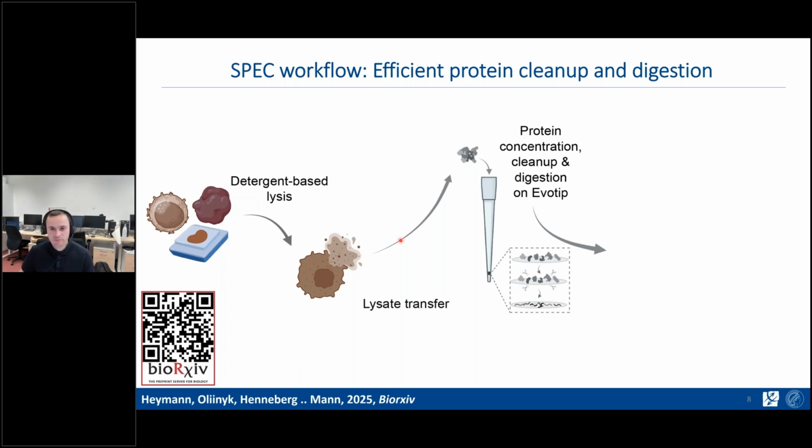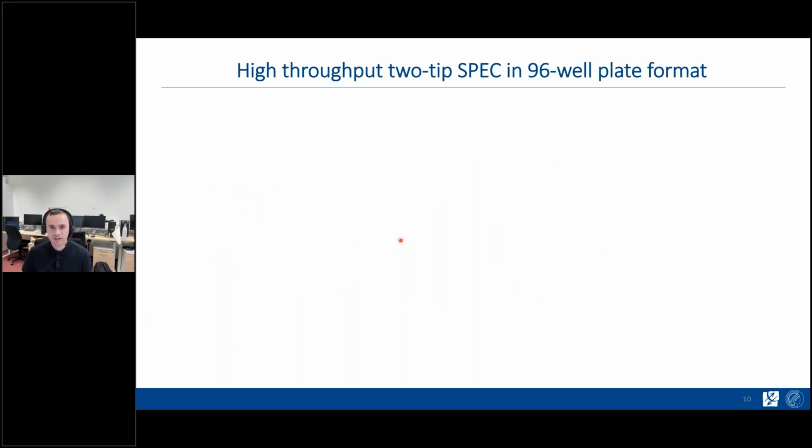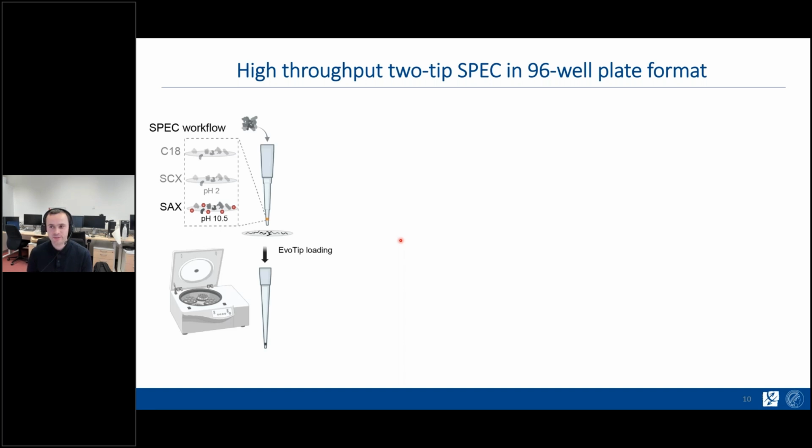After the peptide digest, the Evosep will elute it and analyze it. This actually allows a very high throughput. Since the volume is very small, we can do this very fast. In order to get the most out of it, right now we actually use not C18 SPEC tips but SAX SPEC tips, because they are quite a bit more efficient, or they are easier to optimize.